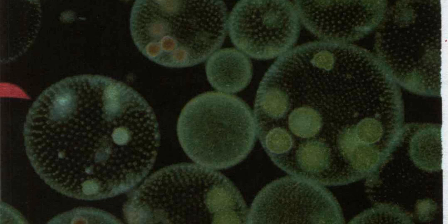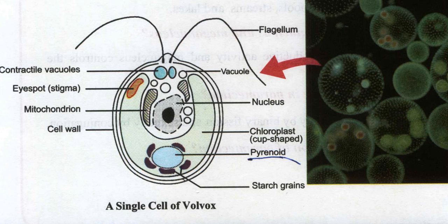This is a volvox colony. As you know, volvox lives in the form of colonies. Now you can observe the single cell of volvox.